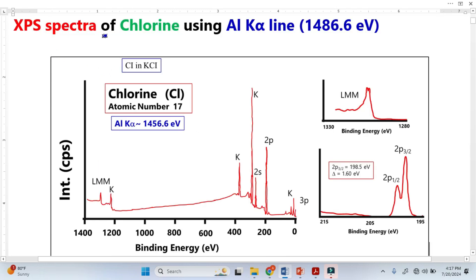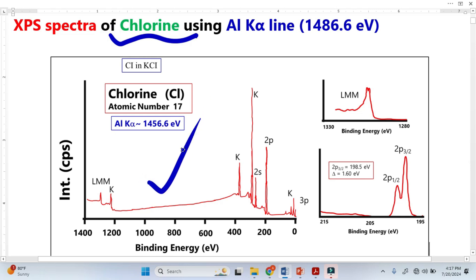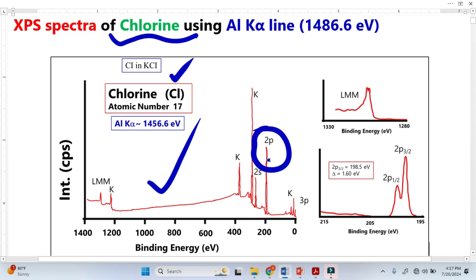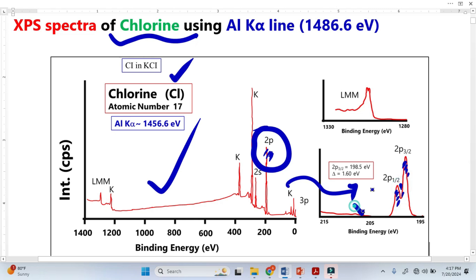This is the standard XPS spectra for chlorine and this one is called the survey spectra. From the survey spectra, we simply identify the types of elements that exist. Now we have to focus on the most important peak — here it is the 2p peak. We do not initially see two peaks, but once we take the high resolution XPS spectra, this peak becomes two peaks. This is what we call the convoluted peak, and the resolved version is called the deconvoluted peak. We can now see the two peaks separated from each other — this spectra is called the high resolution spectrum.